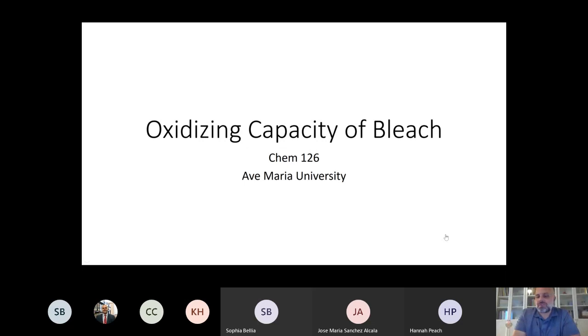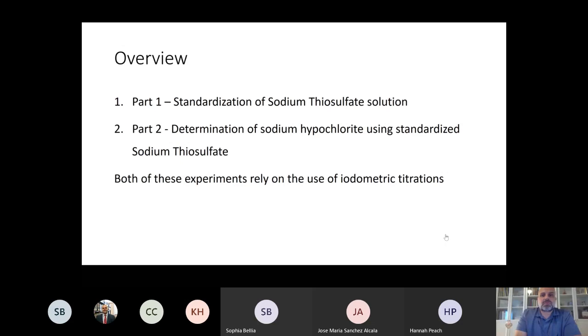I think there's some use from this because, from a classroom perspective, it'll get you used to doing the math that's necessary for this type of experiment. Even from a biological assay perspective, the screens they run to determine who has COVID and the like always have to go through these types of standardizations.